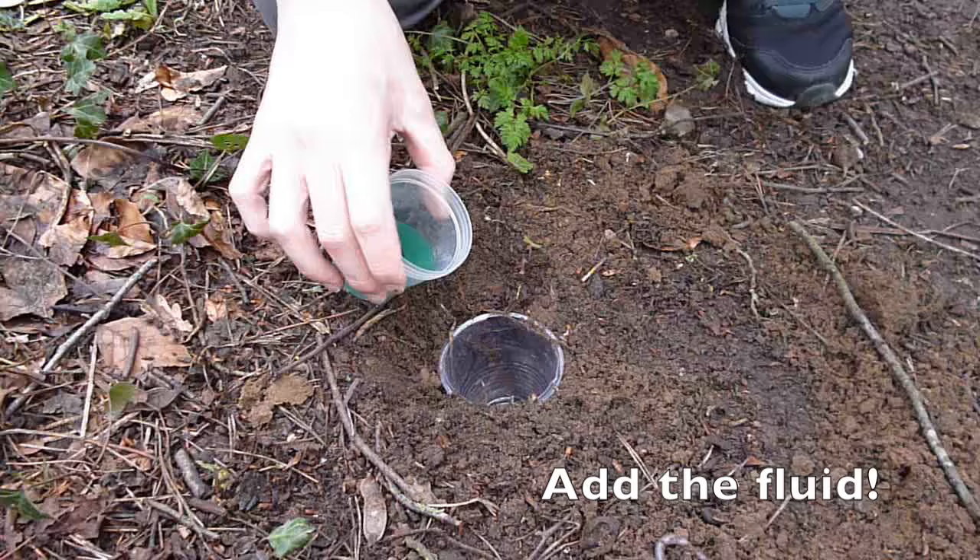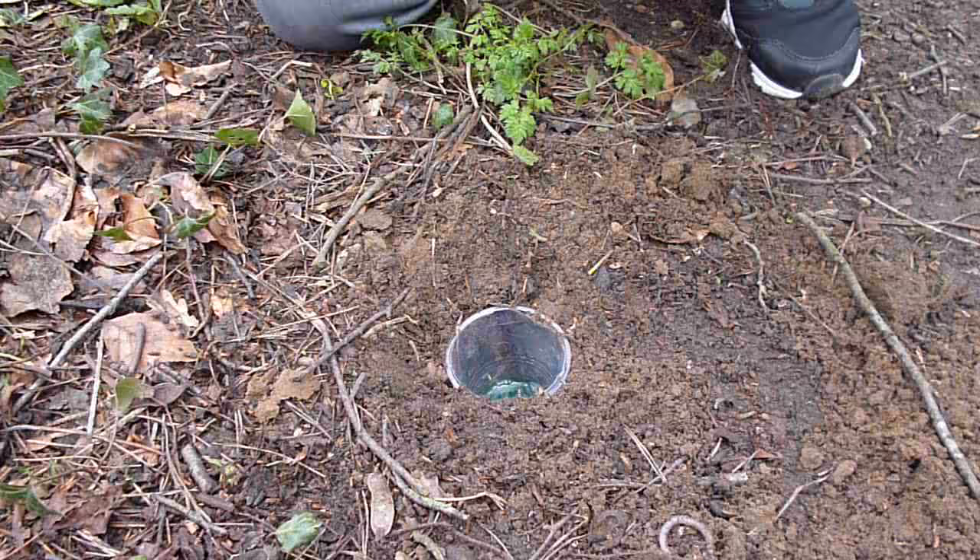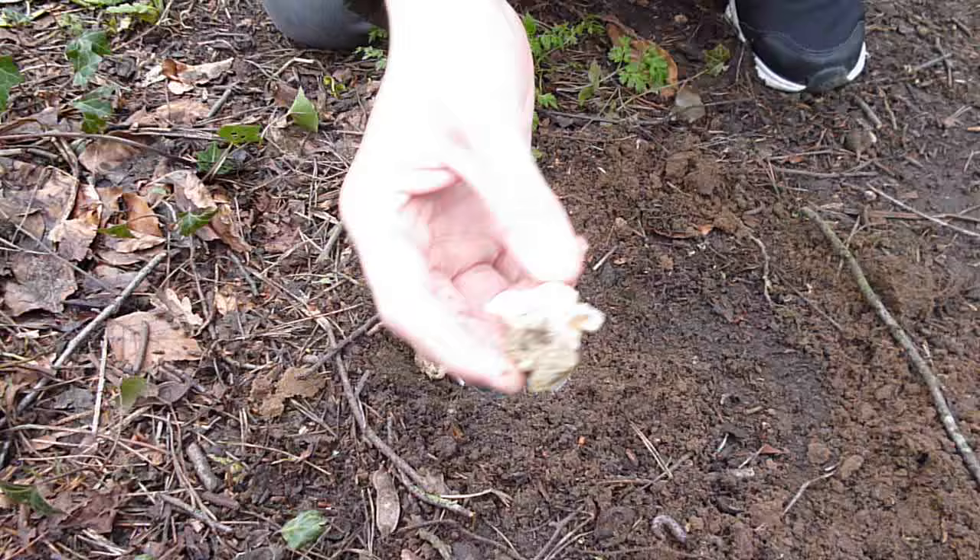You can then proceed to add the washer fluid. It's important to note that if there are cats in the local area, you should not use this fluid. Instead, utilise propylene glycol, a non-toxic alternative to blue screen wash. Remember to place a suitable lid on your pitfall trap, ensuring rain cannot get in.